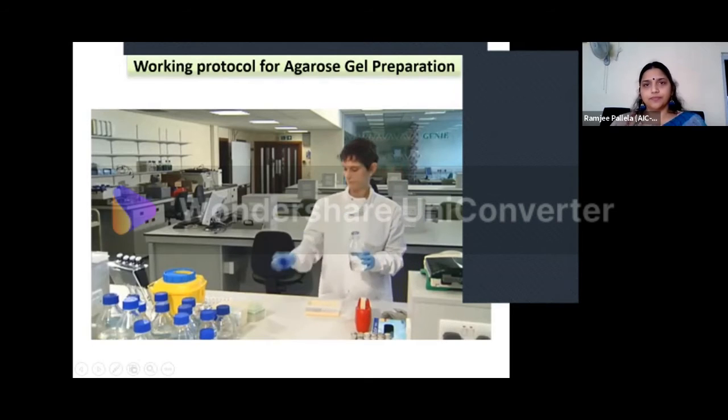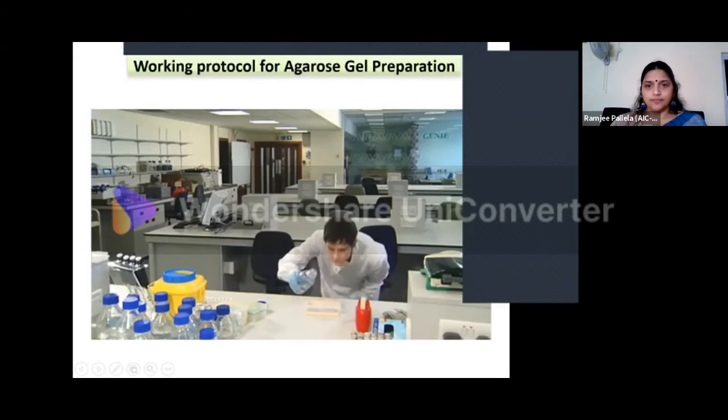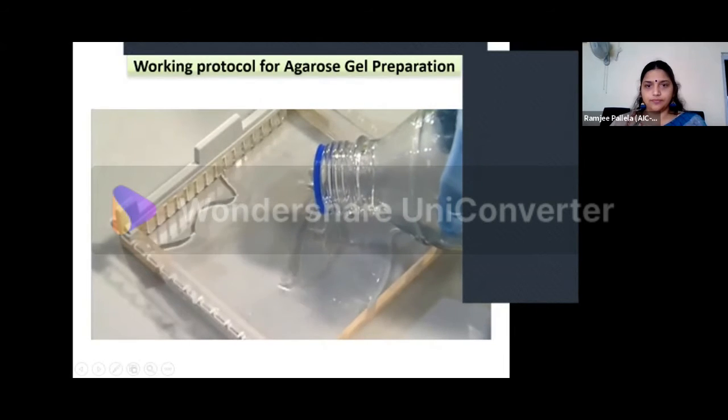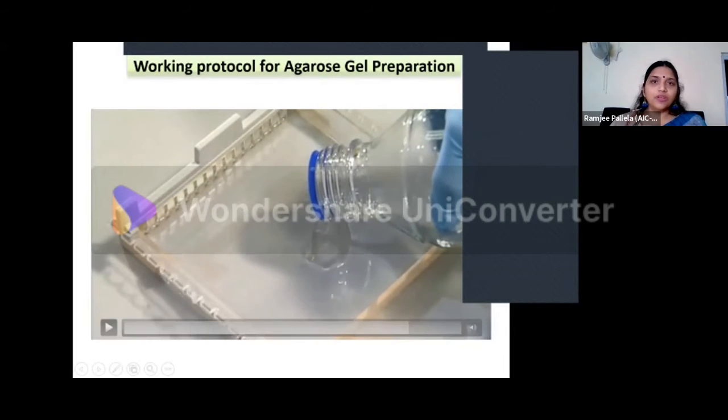Once you've made sure that the gel tray is level and you've inserted the comb, slowly pour the gel solution into the gel tray. Did you listen to it carefully? Slowly pour, because we want to avoid any bubble formation. If bubble formation is there, what will happen? It will interfere with the movement of the DNA along the gel.